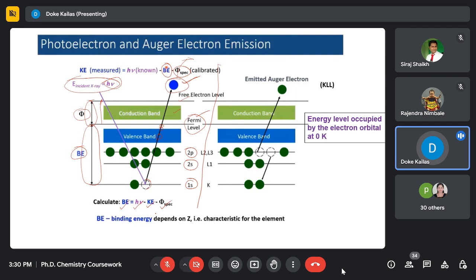So to become stable, an electron from the valence shell or next shell jumps from the next orbit to the inner orbit, or core shell orbit. The energy difference between these two levels is not equal to the incident energy, and therefore with some of the rest of the energy, another electron from the valence shell is ejected, and such an electron is called a secondary electron or Auger electron.